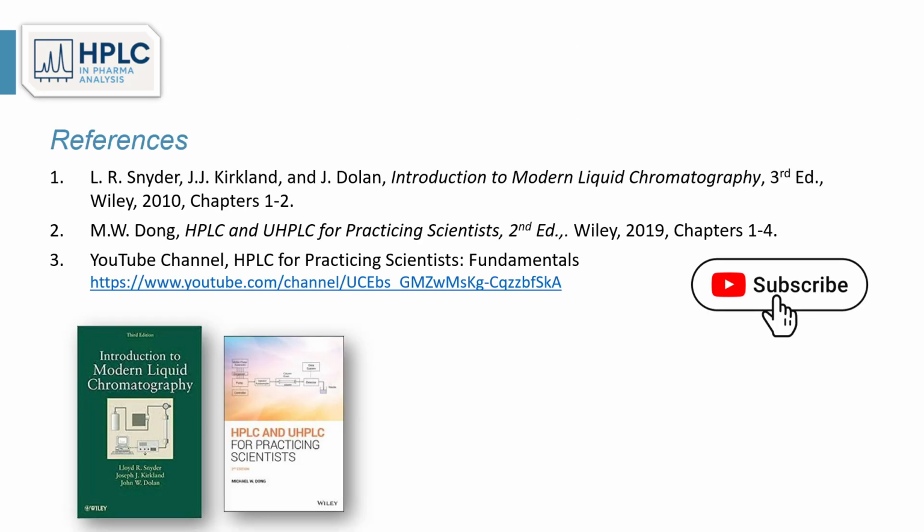Here are a number of references: Snyder, Kirkland, and John Dolan's book, this textbook, HPLC and UHPLC for Practicing Scientists, and also the YouTube channel of the various topics.